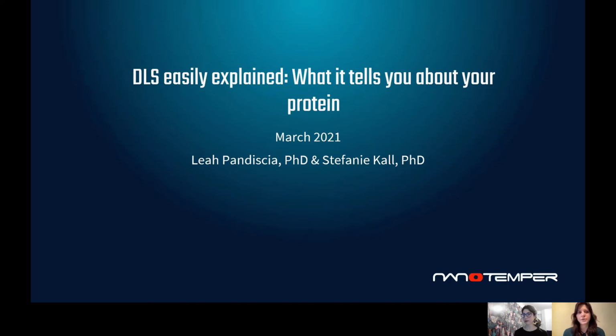So whether it's the beginning of your day or you're winding down for the evening, I hope you find this educational session informative and at least a little fun. Today, we're going to have a conversation about dynamic light scattering, or DLS, and how it can be a really useful tool for learning more about your protein samples. Anyone from a basic science researcher engineering new proteins to a downstream pharmaceutical researcher doing QC on a final product will hopefully see the benefits of DLS.